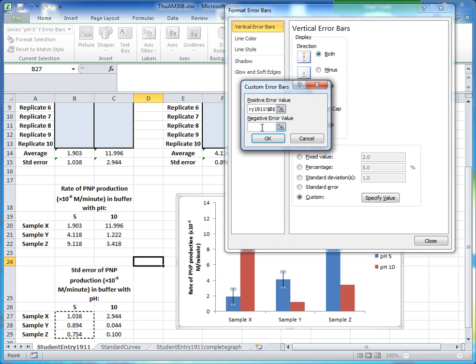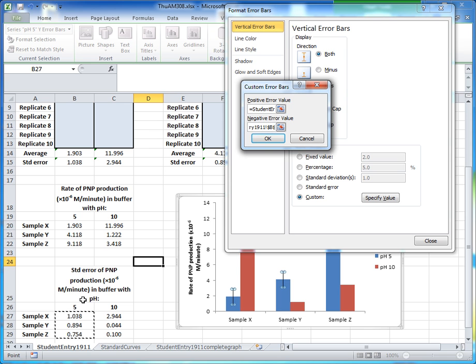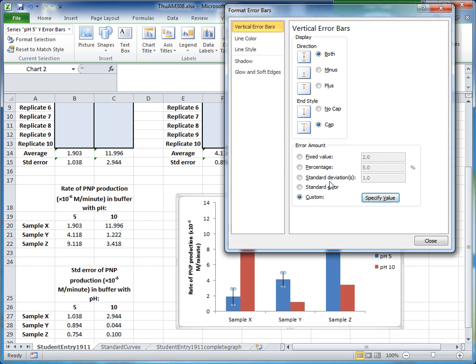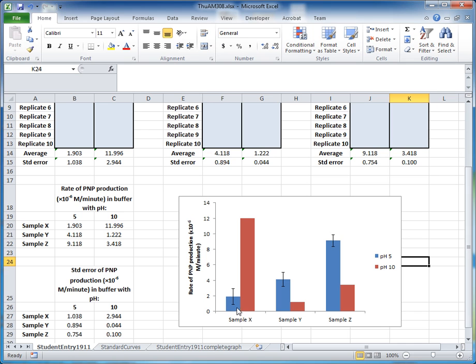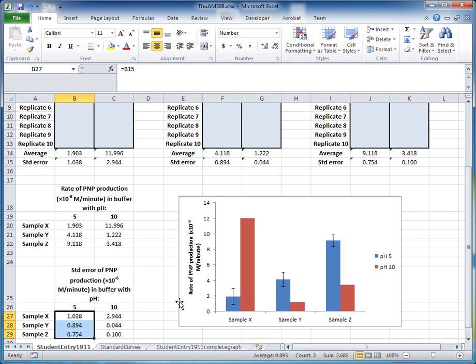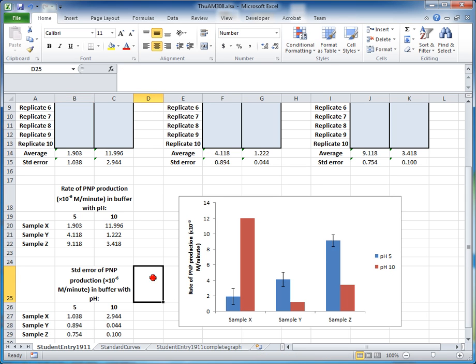The negative error value controls how far down the error bar is drawn. We also want to draw down one standard error, so highlight those same values again, click OK, and then click Close. The error bars now show the standard error values for Sample X, Sample Y, and Sample Z at pH 5.